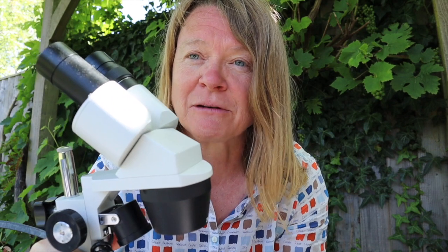I've got a small one here — this is what we call the dissecting microscope. You look down it with two eyes and it's not got really high magnification, but it does enable you to see very small things, even single cells. A good one used to cost a lot of money, but this excellent microscope with really good quality optics cost about 200 pounds. I'll show you some images I took using this microscope with my mobile phone, though most images today I took on a different microscope in the teaching lab at Oxford with a proper camera attached.